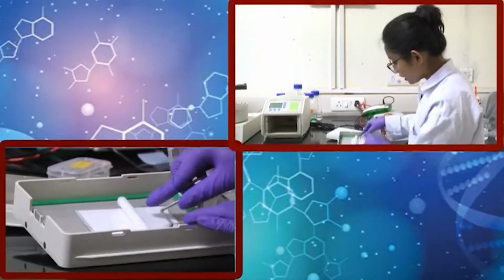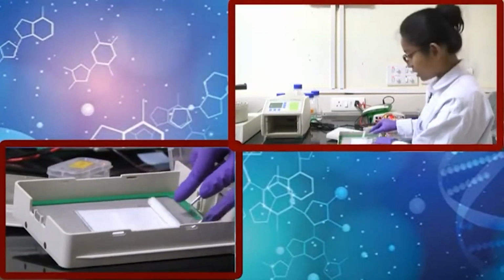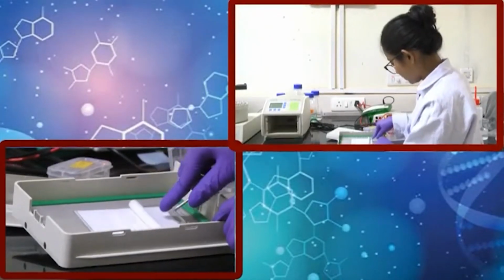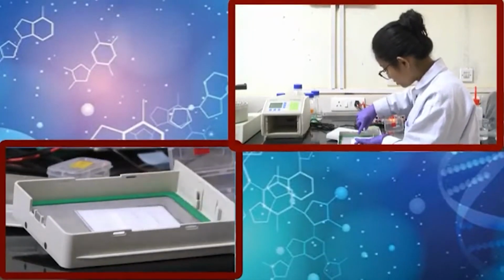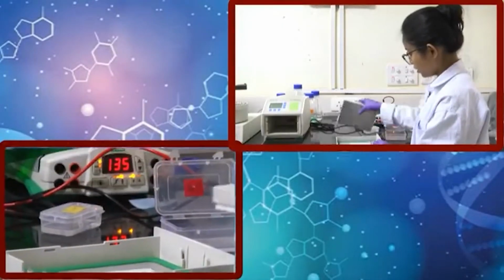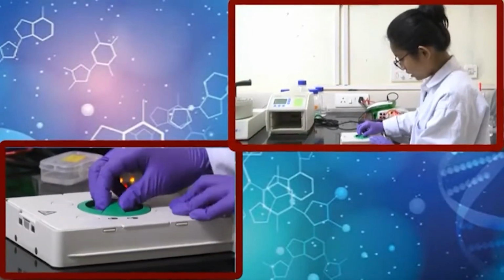Make sure that the gel does not slip out from the middle, otherwise if the membrane is not in contact with the gel, then the protein will not get transferred to the membrane. After you are okay and there are no air bubbles, then we will take the top and we will lock it.